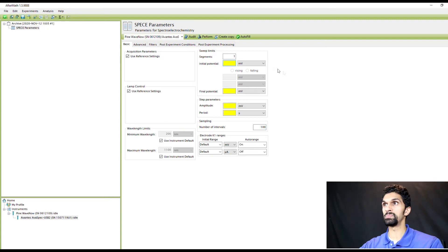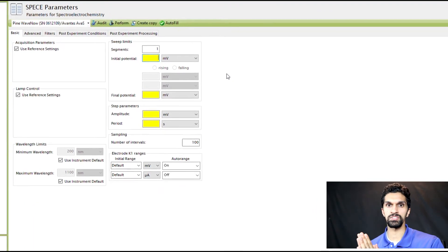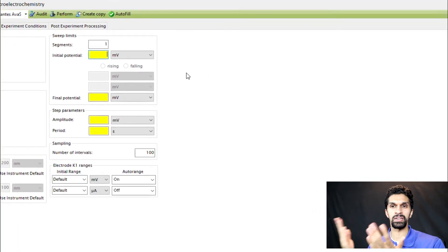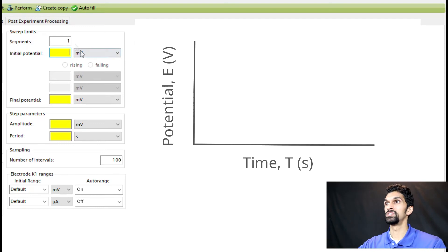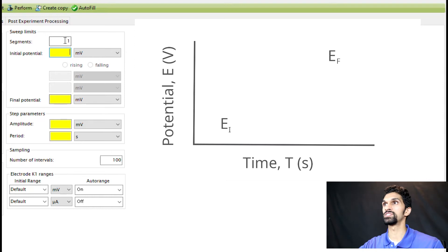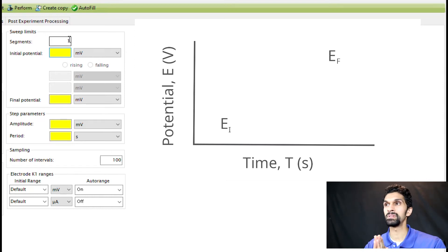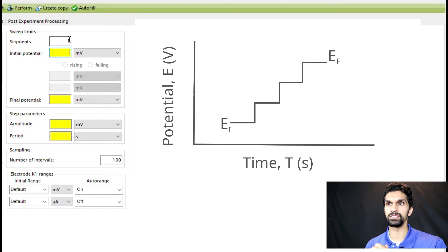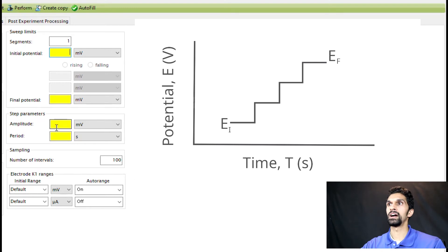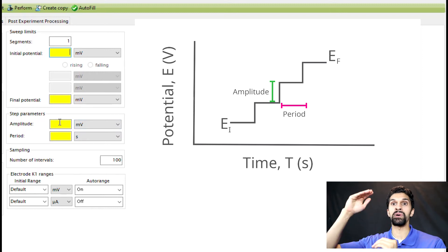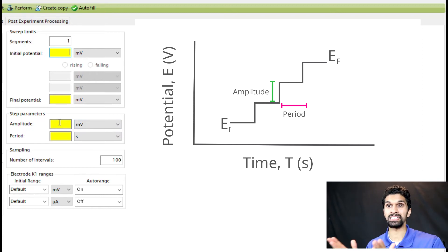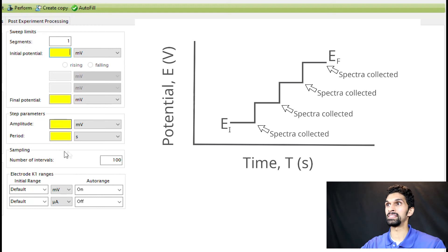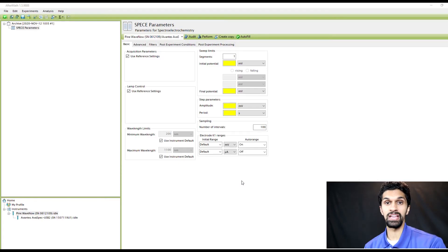Let's go over the sweep limits. In a spectroelectrochemistry experiment, the parameters are designed very similar to cyclic voltammetry. You can think of this as your initial potential where you're starting off. You have some final potential, you may have some number of segments that you sweep. But the actual applied waveform is more like a staircase voltammogram where you will step the potential, hold it for a very specific period of time which is the period. The amplitude is how high of a step that you're making, and the spectrometer will then collect a spectrum at the end of this period.